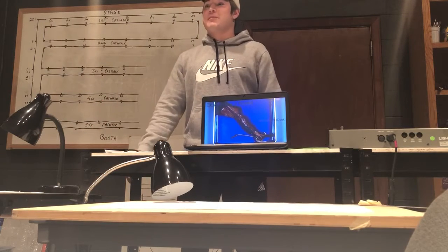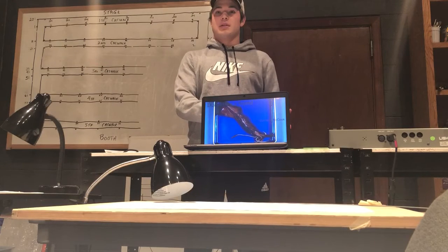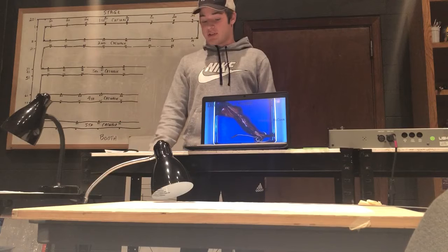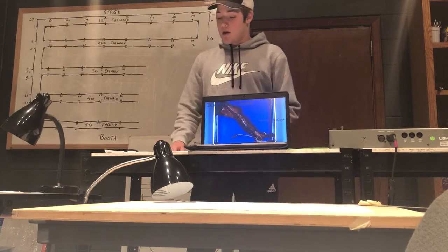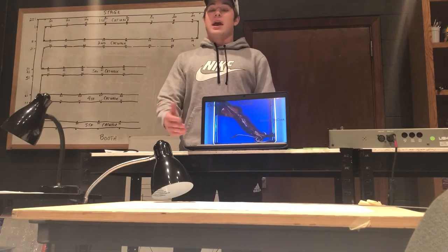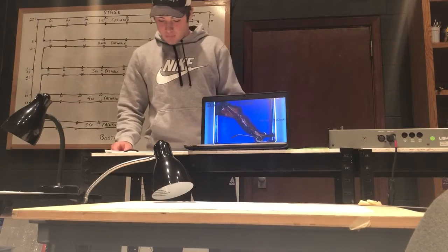Alright, well, that's basically my point. I'm going to be showing everybody how to correctly dissect a squid, and this process can also be used to dissect other things. Basically the safety procedures and how to clean up, with the middle steps depending on how the procedure is supposed to be done. I learned this in my biology 1107B class with Dr. Wendy Wolfram. It consisted of two different presentations, one over the safety of the class and what to do, and another lecture over the actual process of doing the squid, and then she had us perform the actual experiment. Okay.